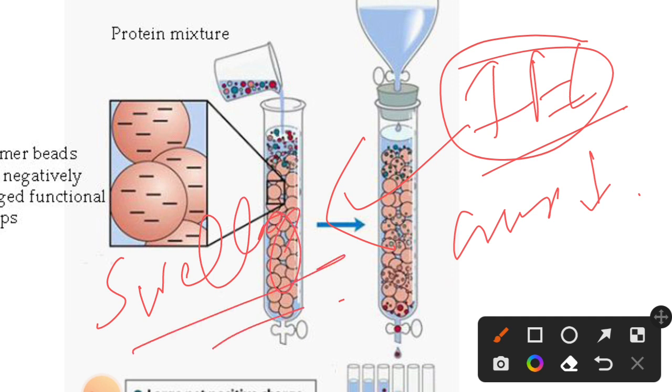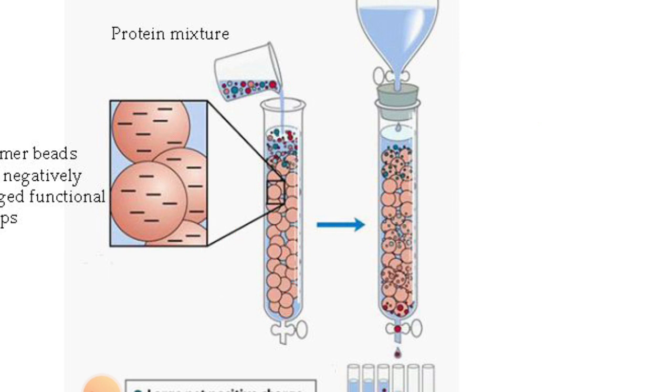Swelling capacity helps in exchange. Why? Because swelling facilitates the exposure of the charge group, which facilitates the interaction of the charge group with protein. Along with this, sample concentration and charge, and buffer charge also play an important role.